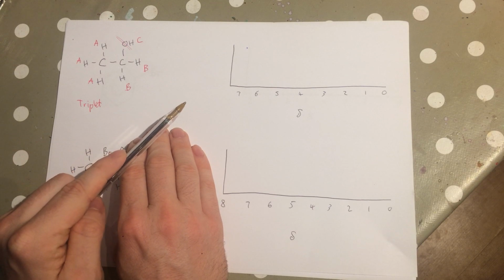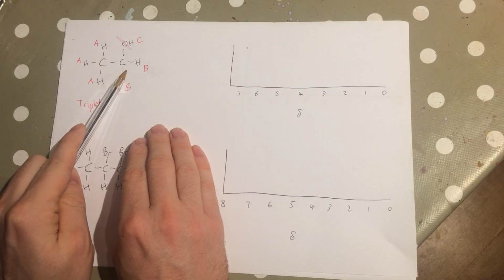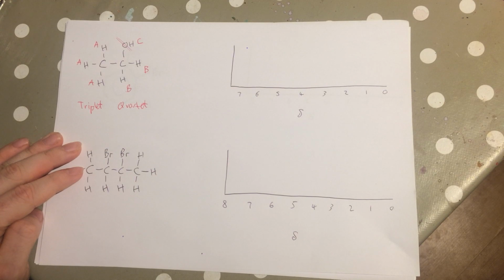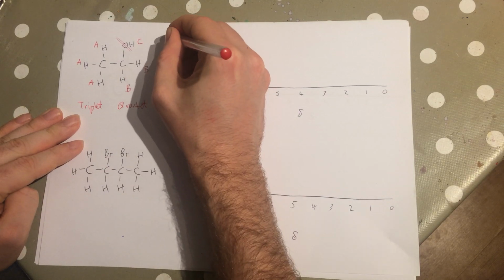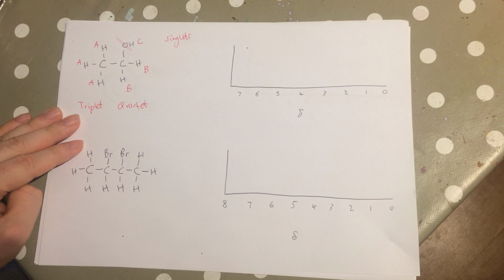So when we're thinking about splitting, ignore the OHs or the NHs. So I would just say I have three adjacent, and so that will be a quartet. And as OHs don't cause splitting or get split, they are always singlets. That's a nice, easy way of figuring out which peak is the OH or NH. If you've only got one singlet, it's the OH or the NH.